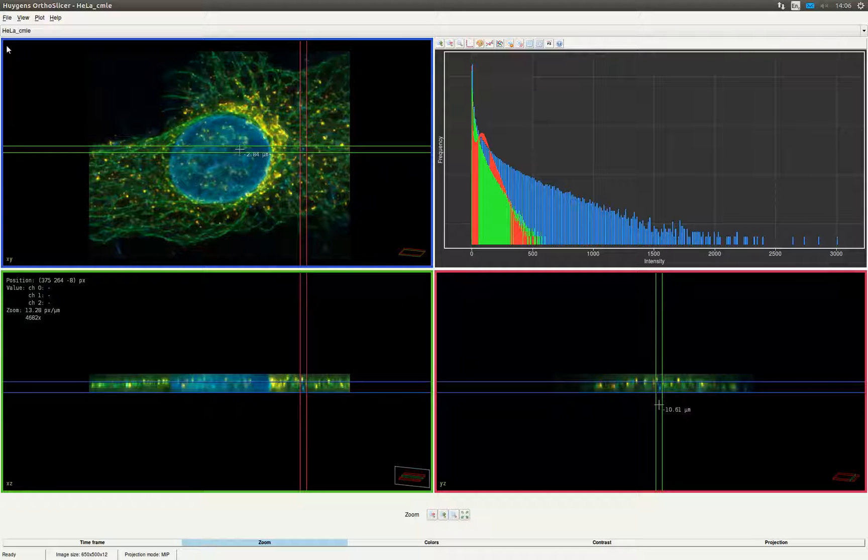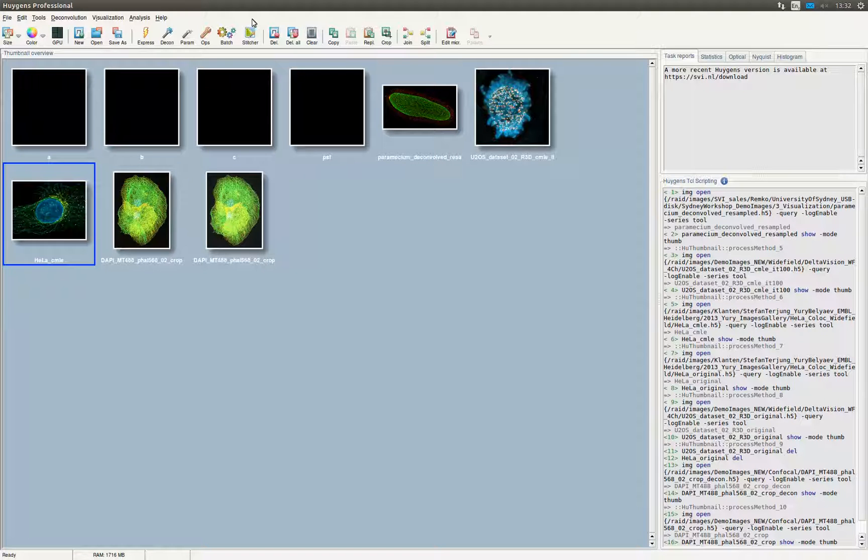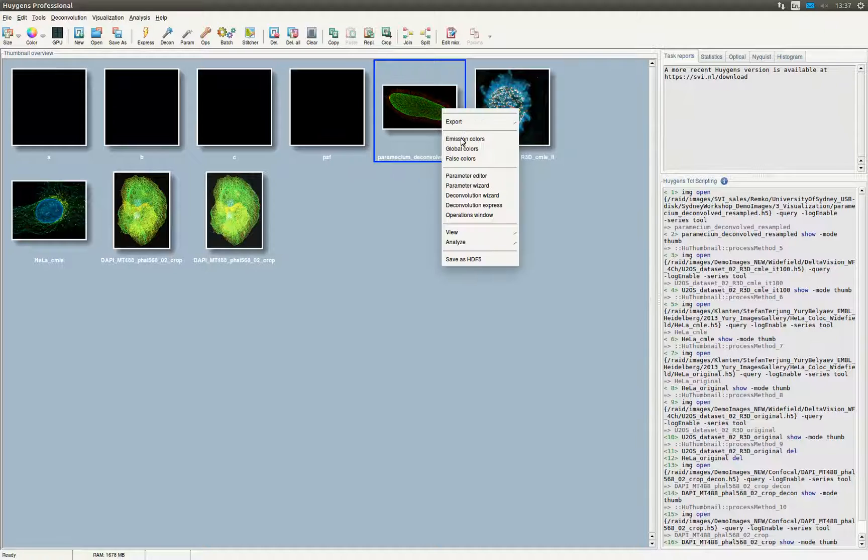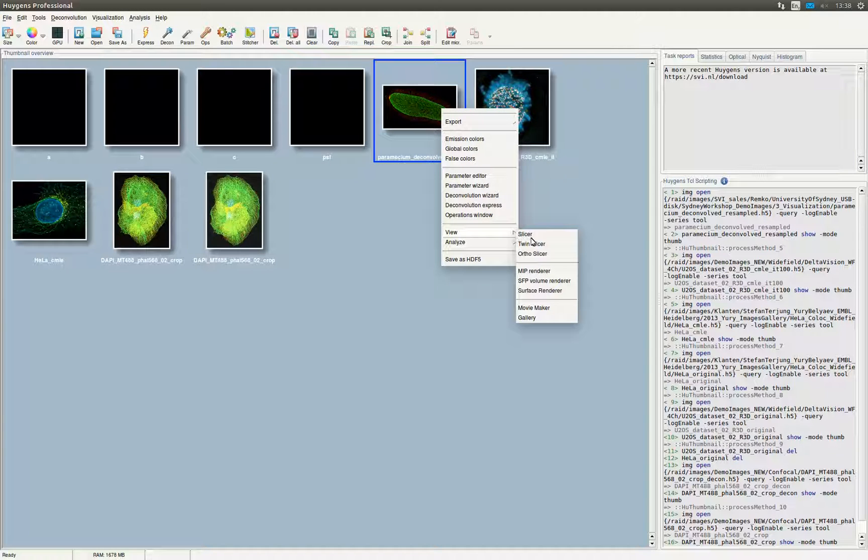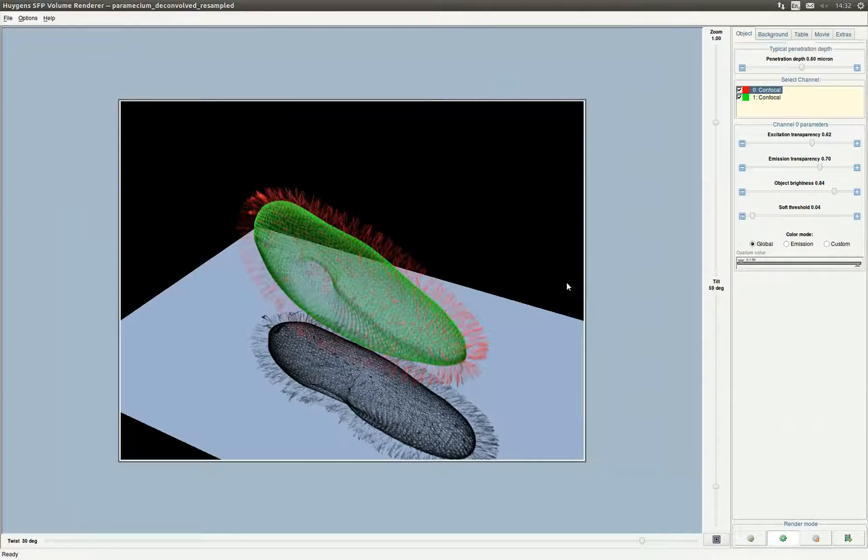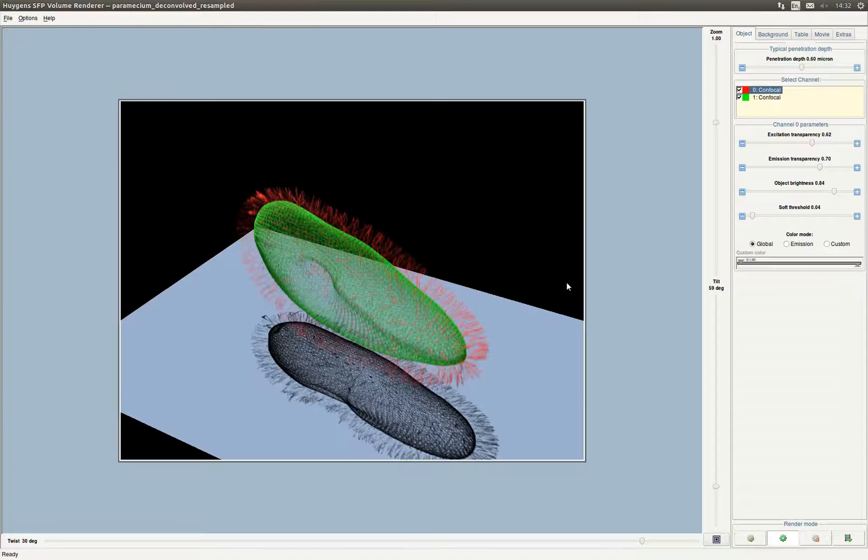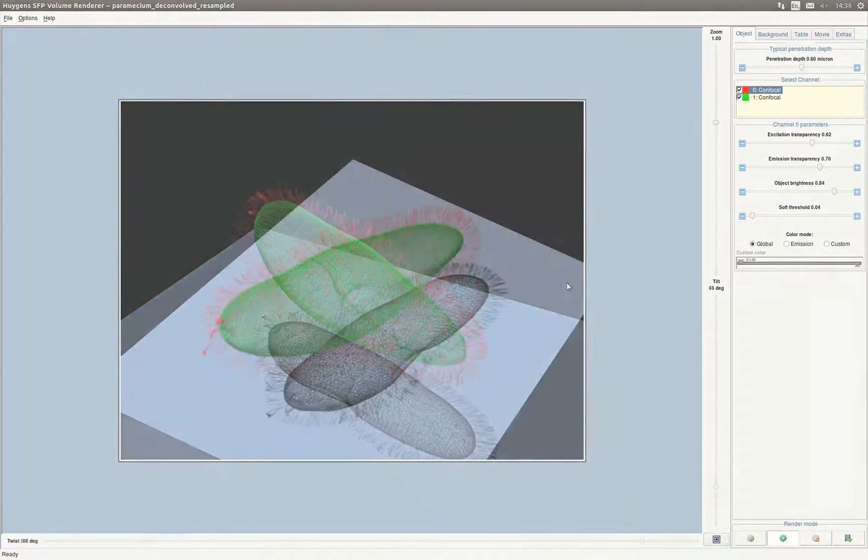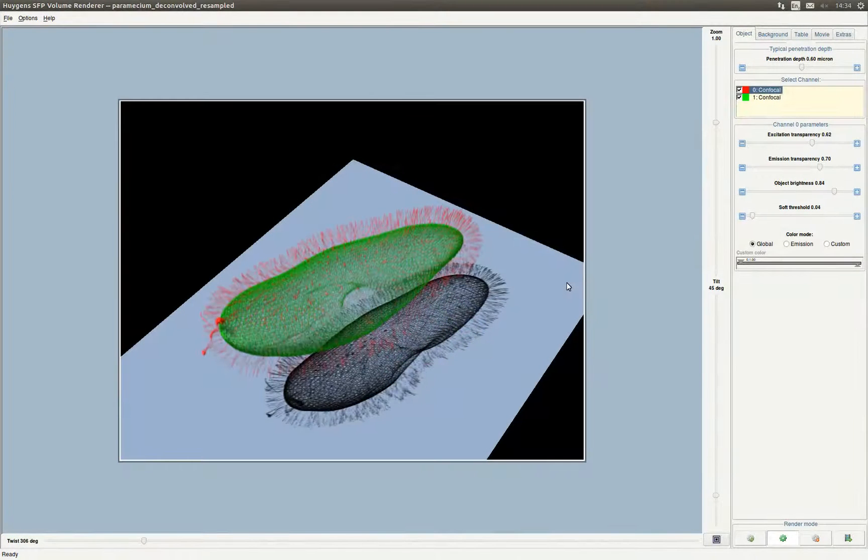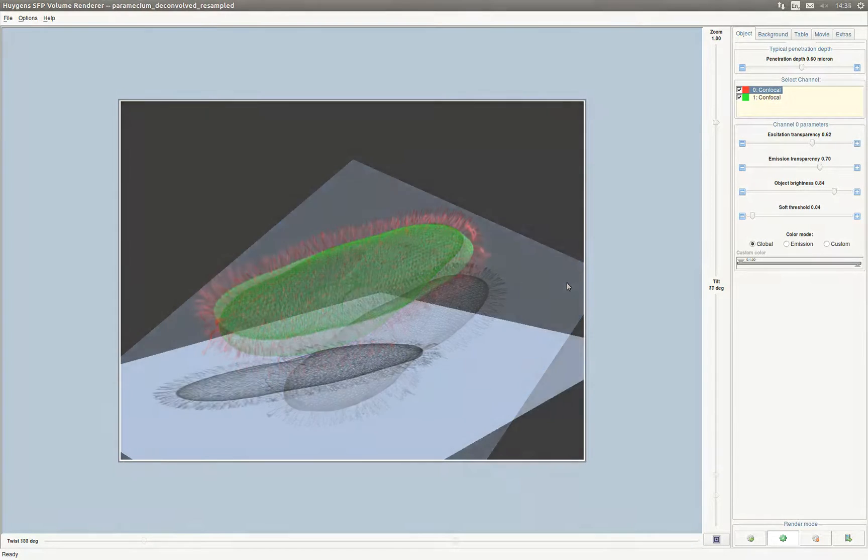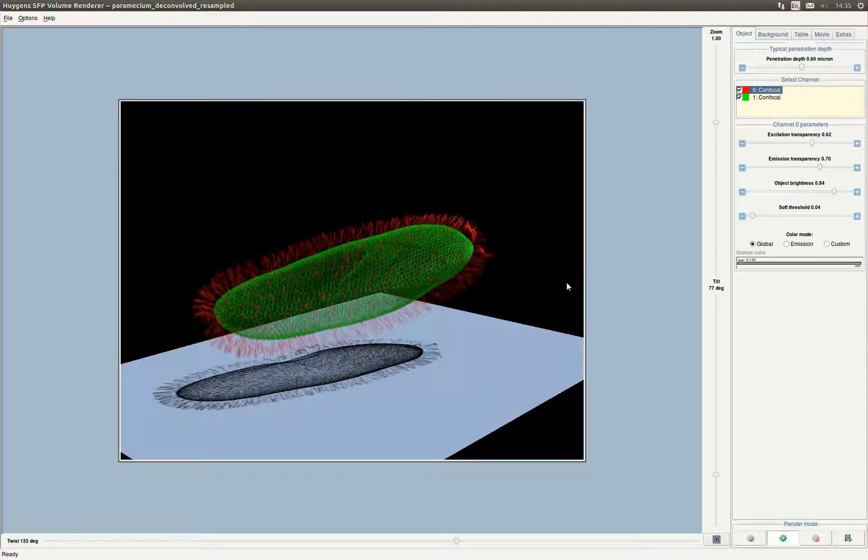We now close the slicer. We are now going to have a look at the SFP renderer. Select the image you want to render, right-click on the image, and go to view. Click on the SFP volume renderer. Now the Huygens SFP volume renderer opens. The SFP renderer generates realistic 3D scenes based on the 3D microscopy image, which is considered as a distribution of fluorescent material. The computational work is done by the simulated fluorescence process algorithm, simulating what happens if the material is excited and how the subsequently emitted light travels to the observer.